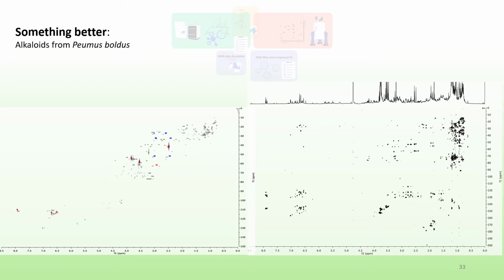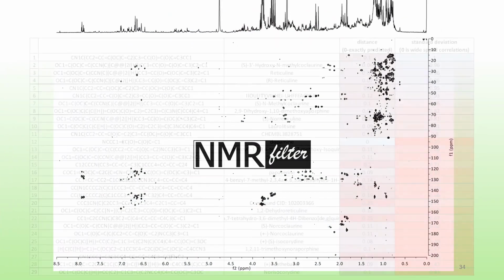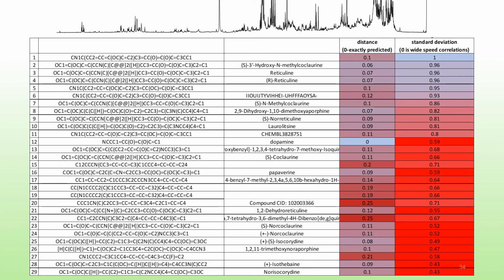I used to do that with my students, but it was a nightmare really. But now using our method, we can better organize everything into a set of most probable compounds in the mixture. Then we start to evaluate each figure with the separated plots for final decision.